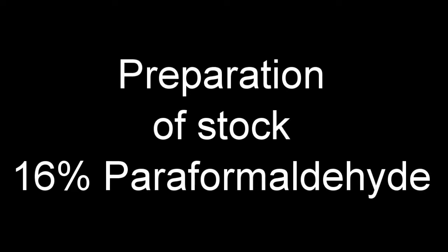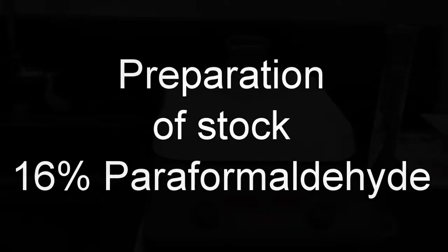This video shows the preparation of stock 16% paraformaldehyde. I'm going to be making 100 milliliters.